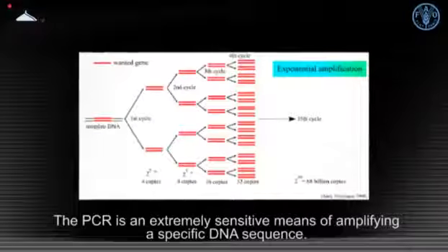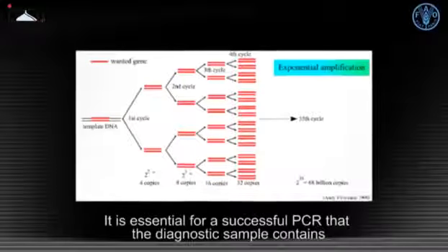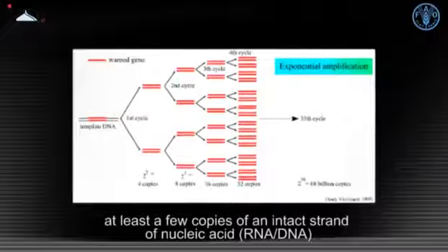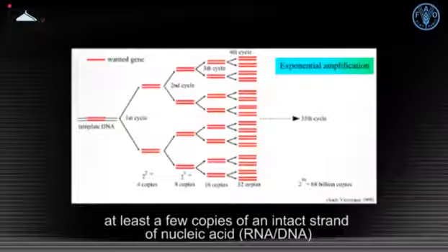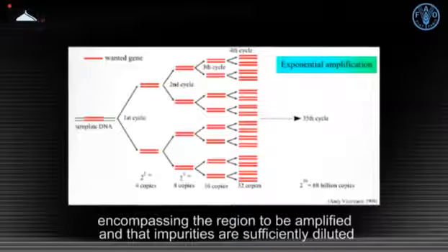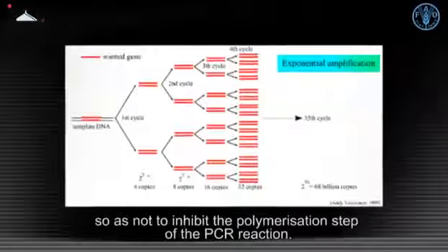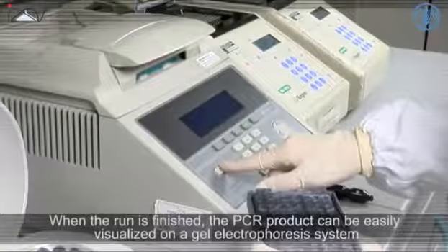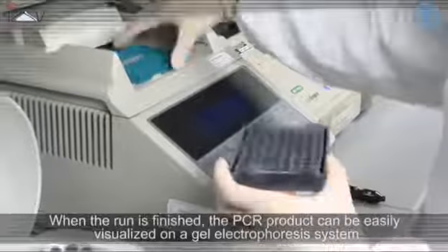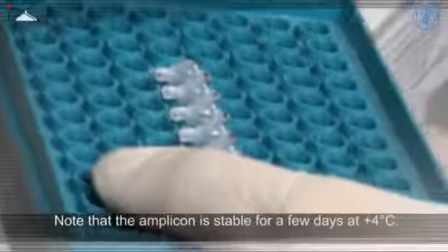Polymerase chain reaction is an extremely sensitive means of amplifying a specific DNA sequence. It is essential for a successful PCR that the diagnostic sample contains at least a few copies of an intact strand of nucleic acid, RNA or DNA, encompassing the region to be amplified, and that impurities are sufficiently diluted so as not to inhibit the polymerization step of the PCR reaction. When the run is finished, the PCR product can be easily visualized on a gel electrophoresis system using a UV light source. Note that the amplicon is stable for a few days at four degrees Celsius.